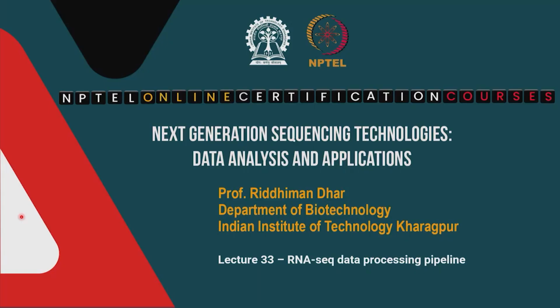In the last class, we had an introduction to RNA sequencing. We talked about different methods, for example, short read RNA sequencing, long read RNA sequencing and direct RNA sequencing. So, we will now slowly get into the methods. How do you actually process the data, how do you set up the pipeline, and what kind of tools and methods do we use?